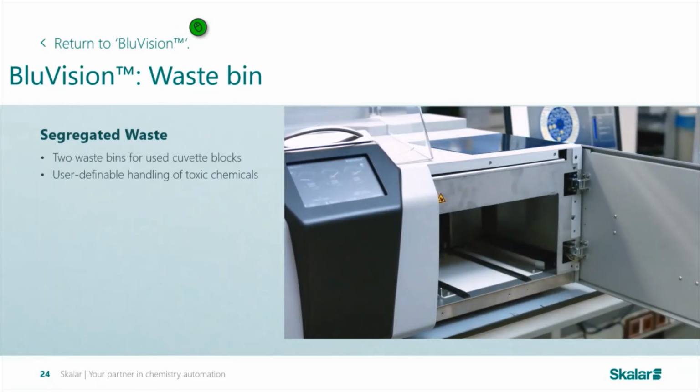The first is safety. So being able to separate waste based on whether they are acids and bases, or acids or reagents containing potentially liberatable cyanide compounds or other toxic chemicals. And this is, of course, commercially interesting. Separating hazardous and non-hazardous waste is quite a significant contribution to the total running costs of a laboratory.